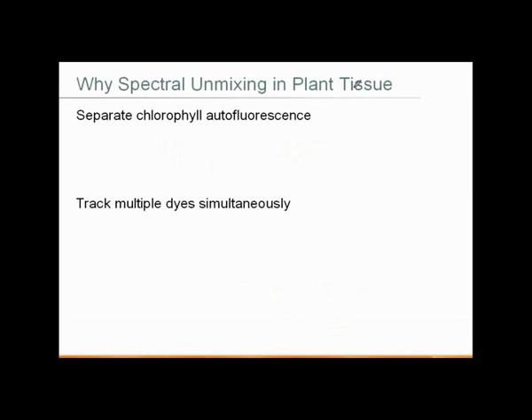By then calibrating the system based on pure spectra at individual pixels, it then separates out automatically each fluorophore into its own channel, minimizing crosstalk between all four samples.